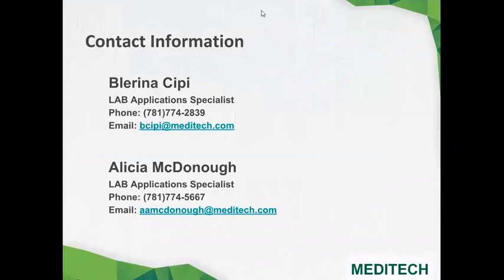So the pictures are uploaded to the computer, so you would choose your user here. And then these would need to be uploaded to the MIS picture routine. So that is done through MIS. And then once the pictures are in the MIS picture routine, you can associate them here to the user. If you have additional questions about how specifically that is done, I would suggest you reach out to your MIS specialist since that's done specifically through their routine.